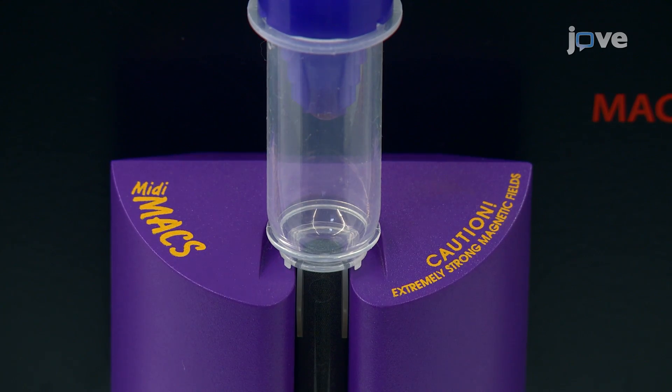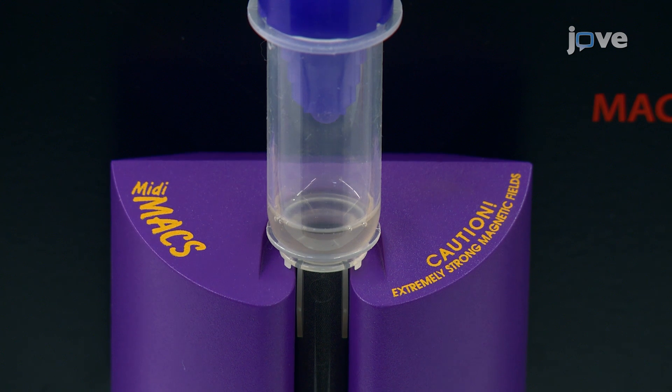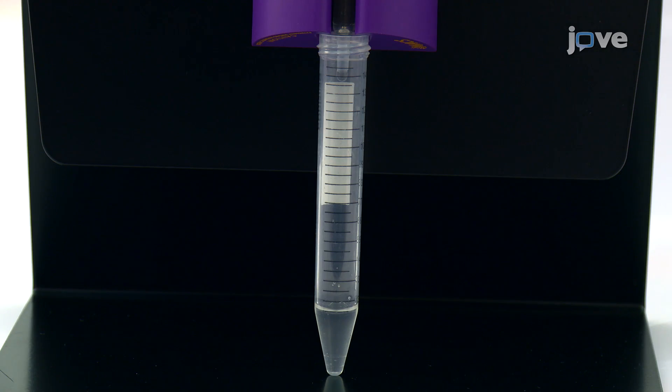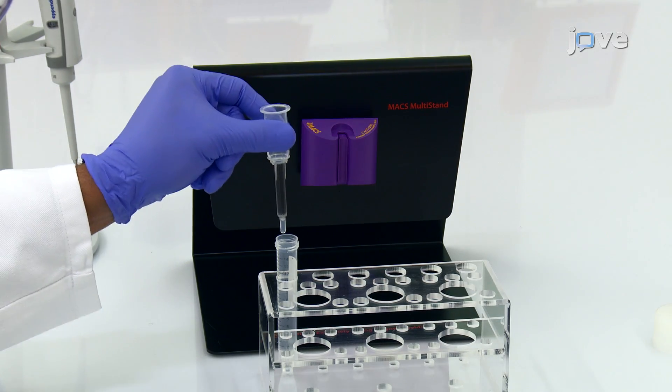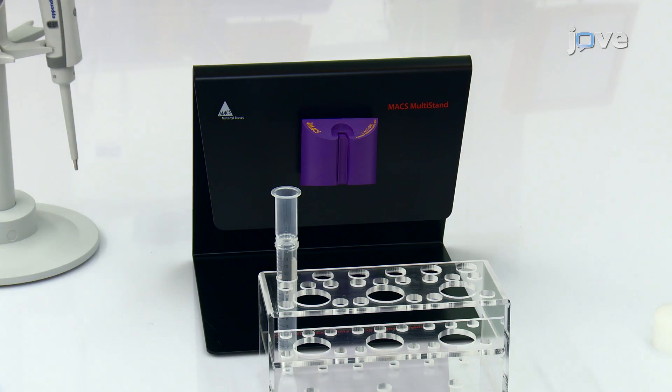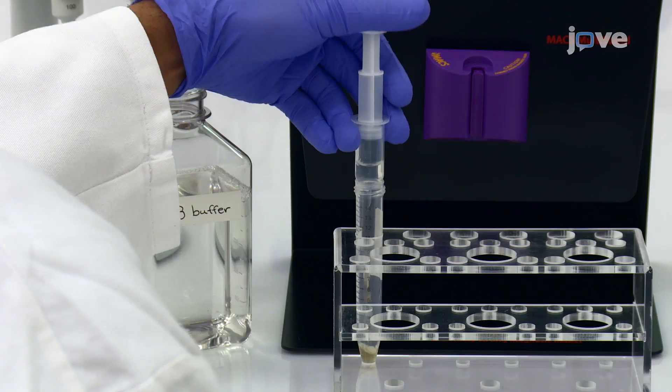As soon as the reservoir is empty, wash the column 2 times with 1 milliliter of buffer, collecting the eluate in the same tube as the negative cell fraction. To collect the magnetic bead-bound mouse cells, transfer the column into a new conical tube and plunge 3 milliliters of buffer through the column.